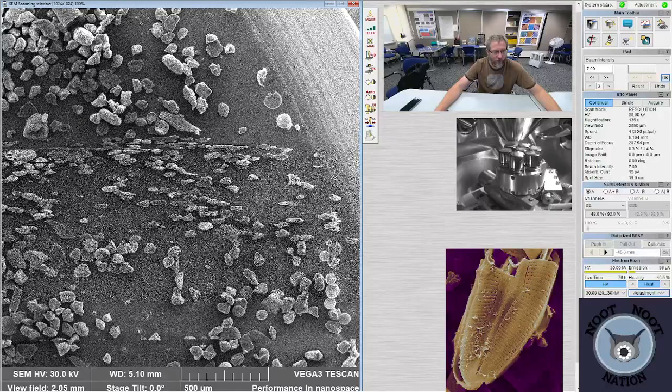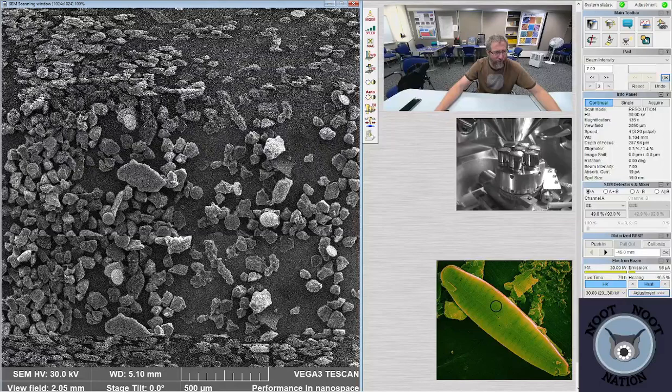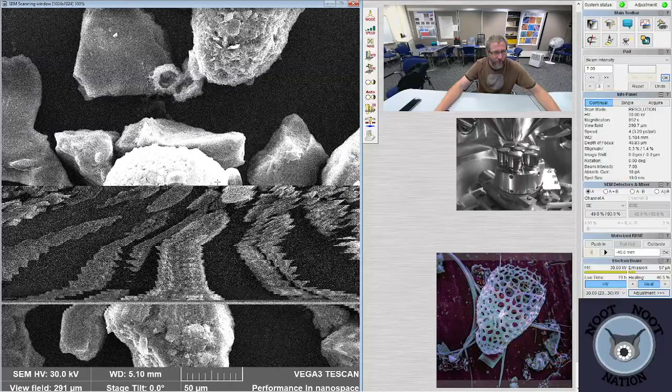We saw another one that was just like the centerpiece of that. I just couldn't tell what it was without any context, but now I know. A lot of times that's what I have to do, is go look around on the slide if I find a fragment of something and try to figure out what it was. Tintinnid. Poop.